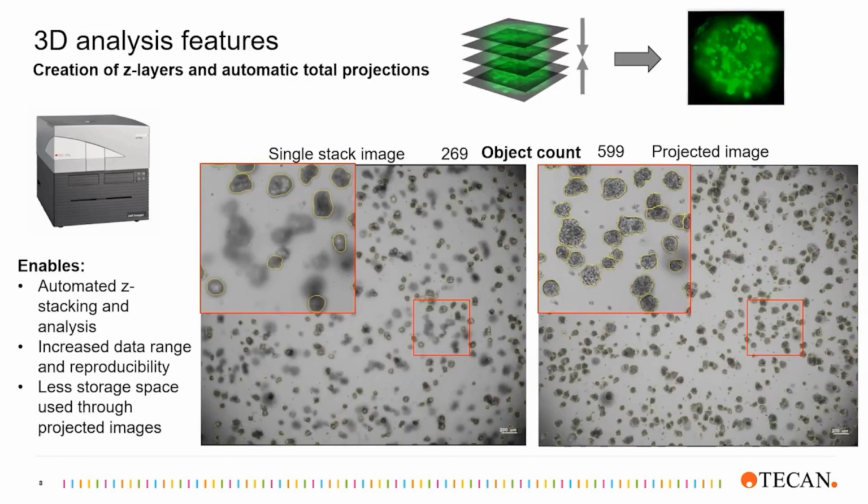Now imagine a typical situation where multiple 3D objects have been growing in a matrix and they are not positioned in the same optical plane. For this scenario, the included Z-stacking functionality is particularly useful, allowing the acquisition of multiple images in the Z dimension. After acquisition, the in-focus information of each layer of the Z-stack will be projected into one image, a Z projection. This image is the basis for the segmentation of the algorithm.